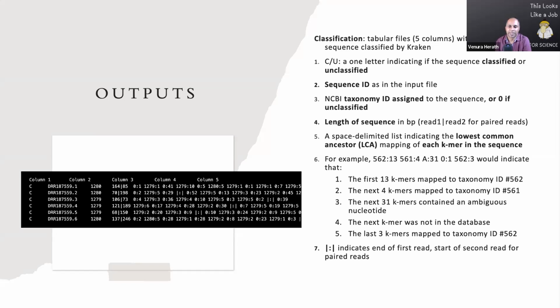So this is basically an overview. Then I will ask a couple of questions regarding your output. When you answer the questions, if you see any deviations, let me know, because for some of us we had to use a different database. Shall I move into the questions?